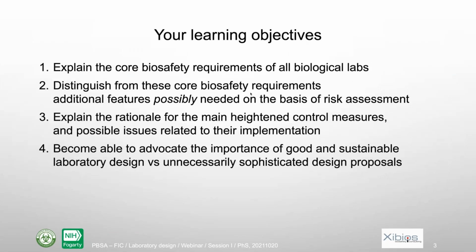So your learning objectives should be first to become able to explain the core biosafety requirements of all biological labs. So you should know and be able to explain what is needed in all biological labs. Then you should also be able to distinguish from these the core biosafety requirements needed in all labs and some additional features that could possibly be needed based on risk assessment. You should also be able to explain the rationale for those control measures and possible issues related to their implementation, to their use.